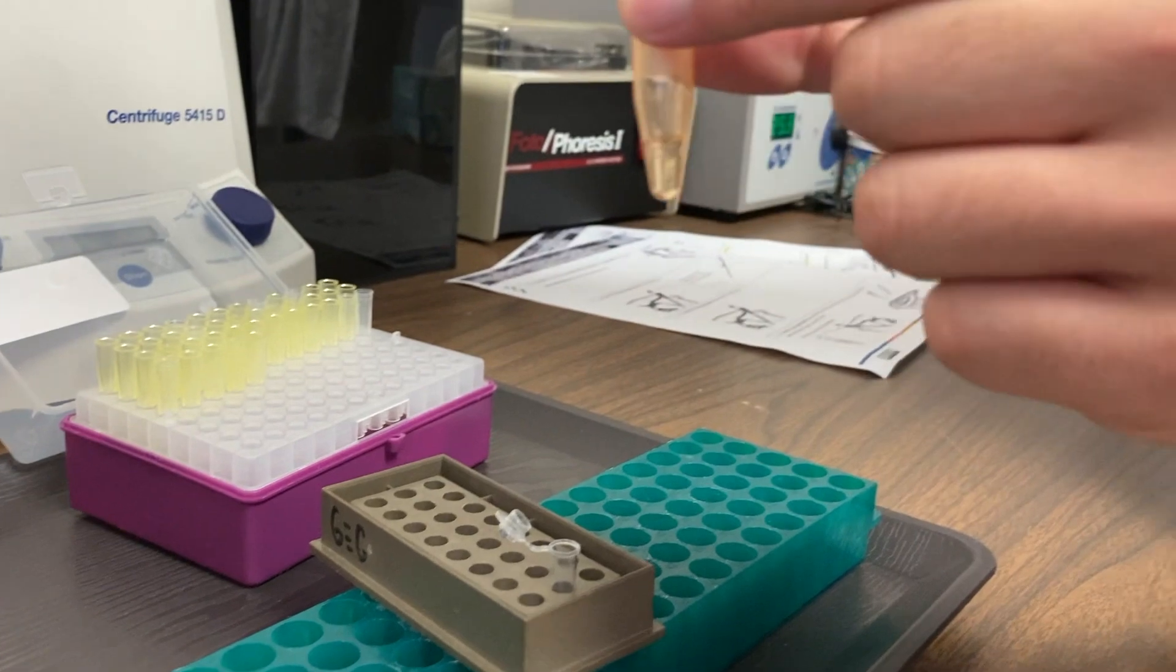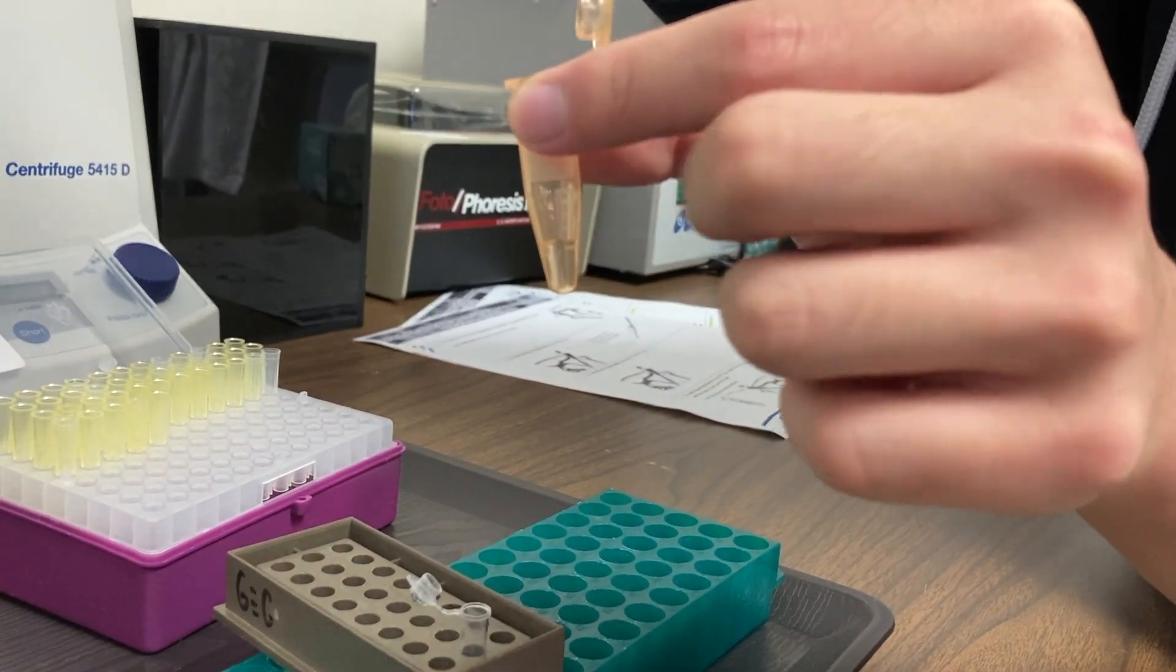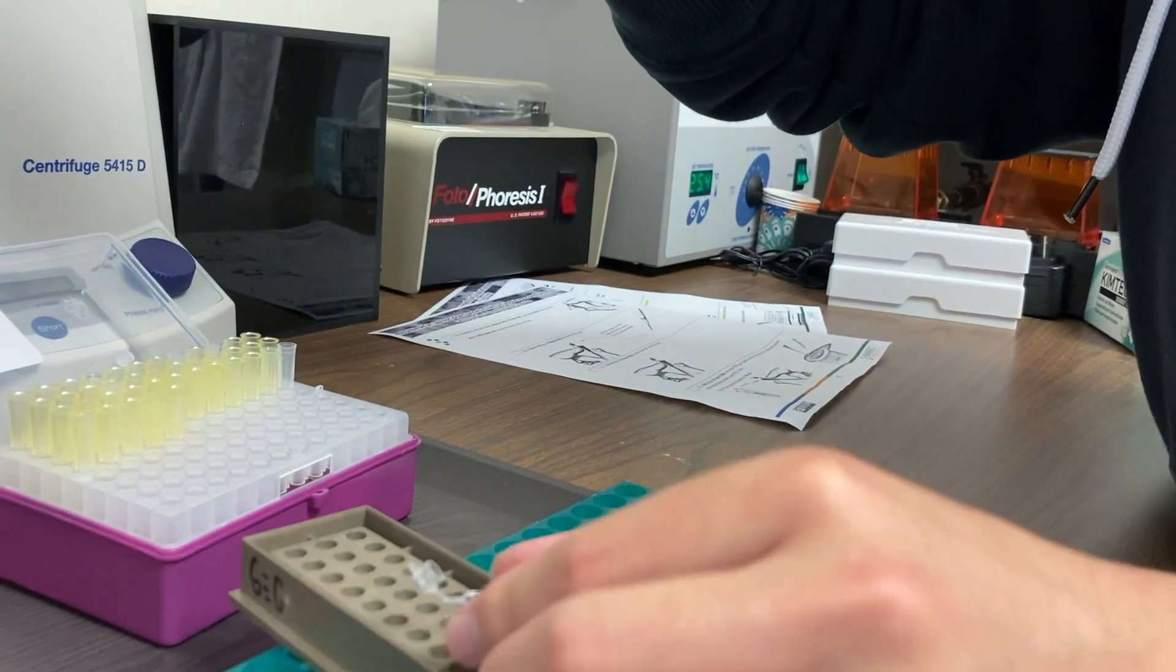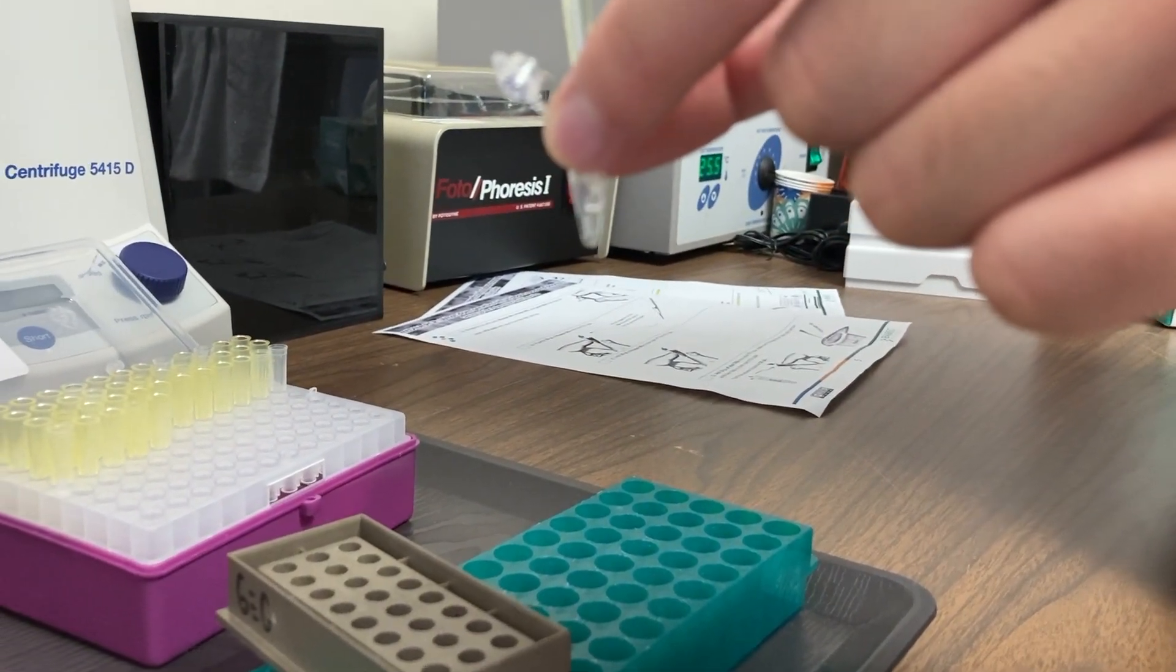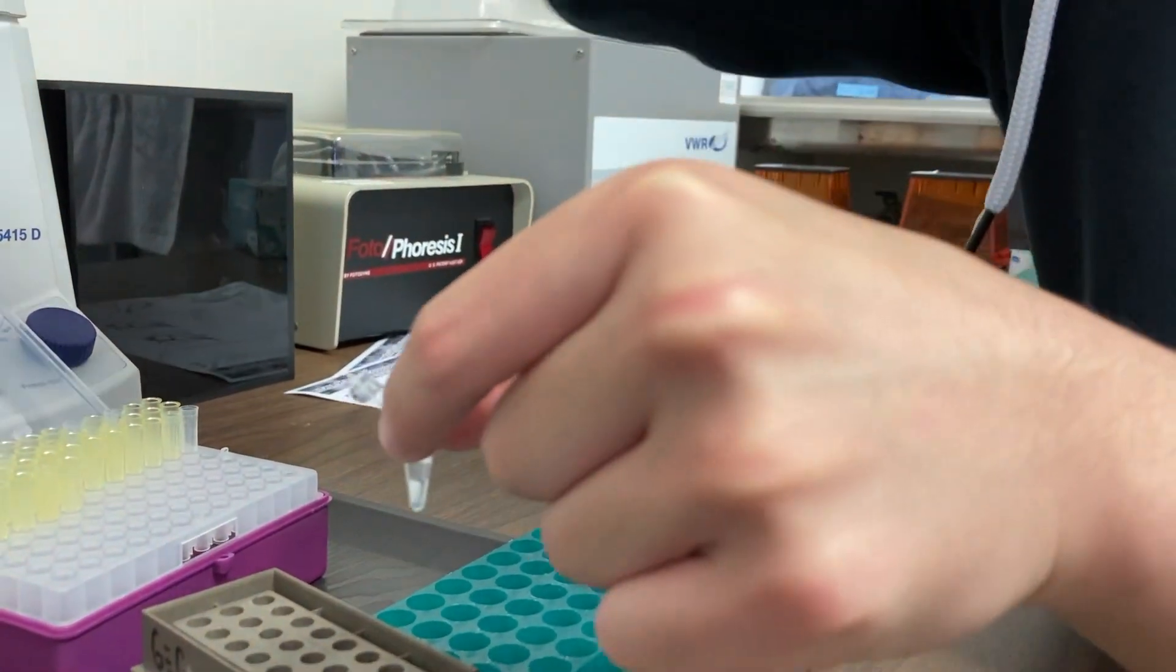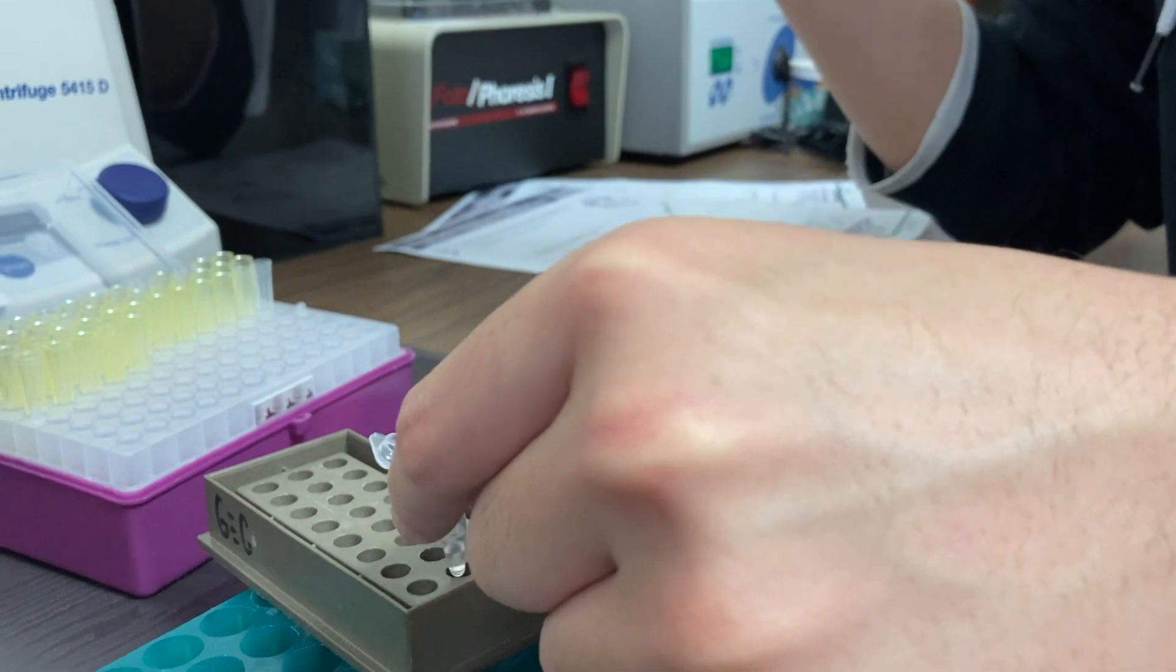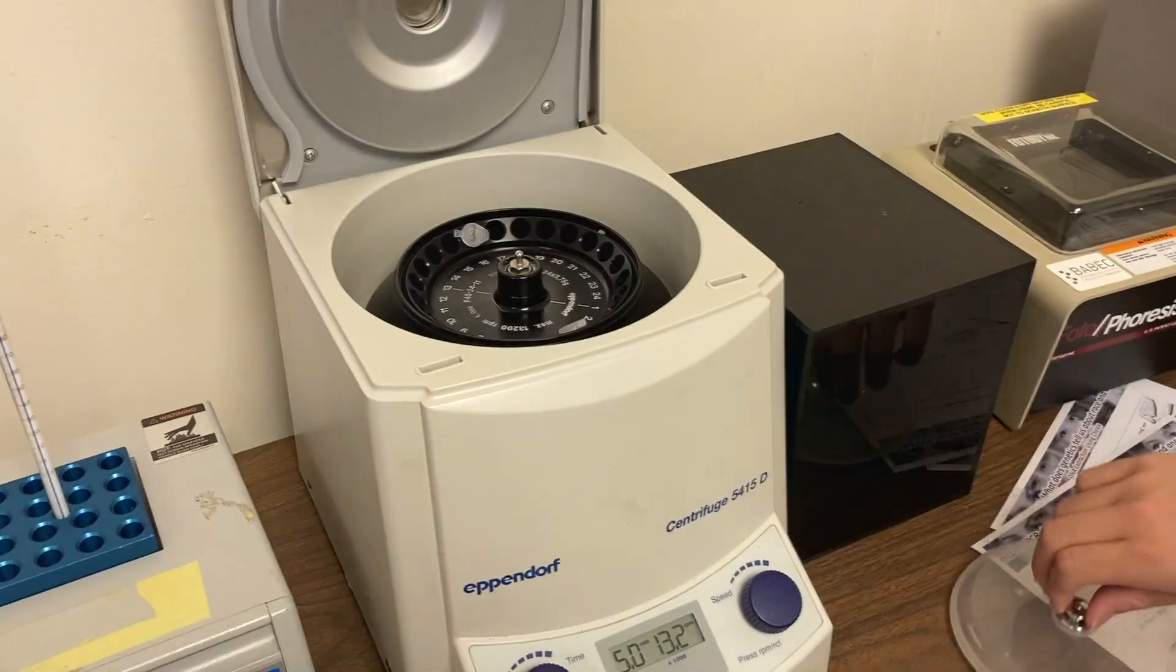After that, we'll get a fresh tip and we'll add our primer mix. What the primer mix does is it allows us to make millions of copies of our exact target DNA. We don't want to make millions of copies of any DNA. The primer mix allows us to be specific about what we're amplifying. So we've added our primer mix and our master mix to our tube.